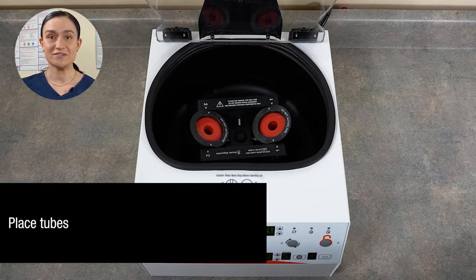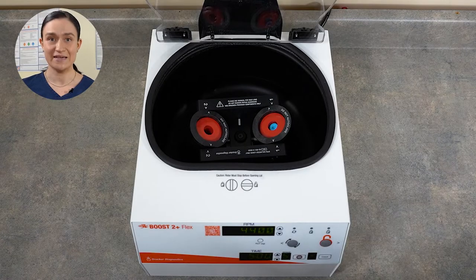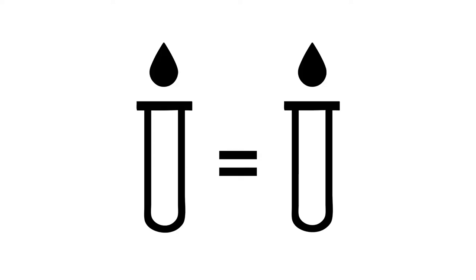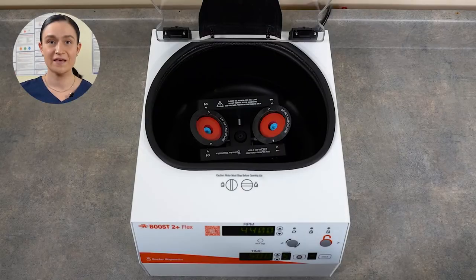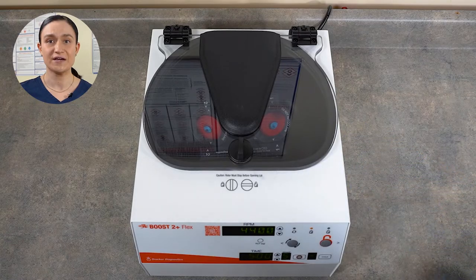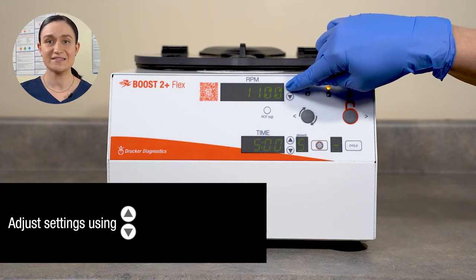Step 3: Place your sample. It should be securely seated within the insert or bucket, but it does not snap or click into place. If only spinning one sample, you'll need a counterbalance in the other bucket. This should be an identical tube filled with an equivalent volume of water — the counterbalance should be roughly the same weight as your filled tube. With your buckets placed, your inserts if needed inside them, and your tubes or tube and counterbalance in place, you're ready to spin. Close the lid and secure the lid latch by pressing it down gently and turning it a quarter turn clockwise. Next, adjust your settings — you can adjust RPM and time using the buttons next to their display windows.